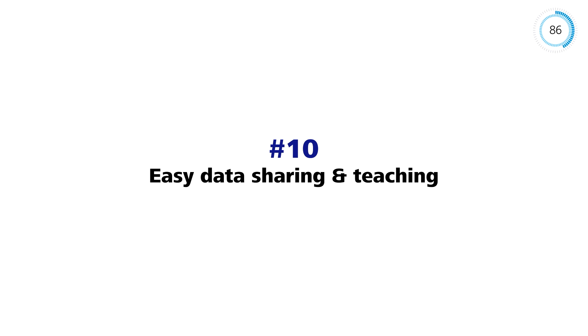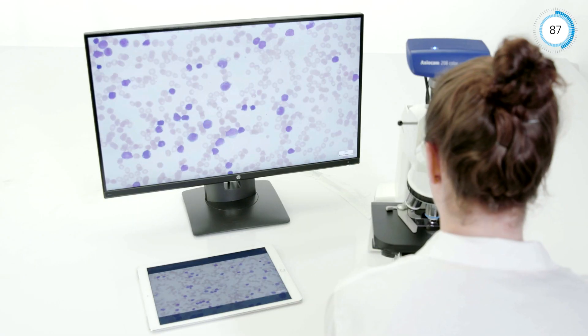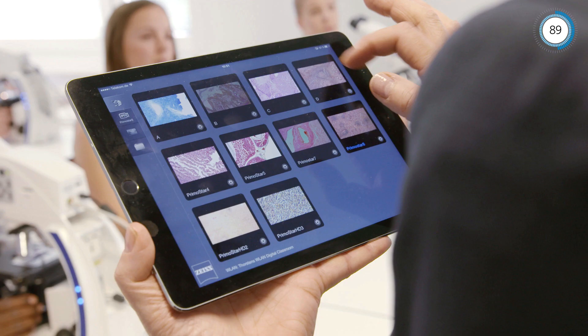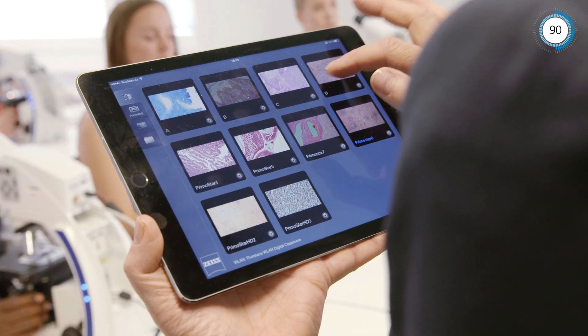These smart microscopes can be interconnected and it's very easy to share images with each other. For further information, visit our website.